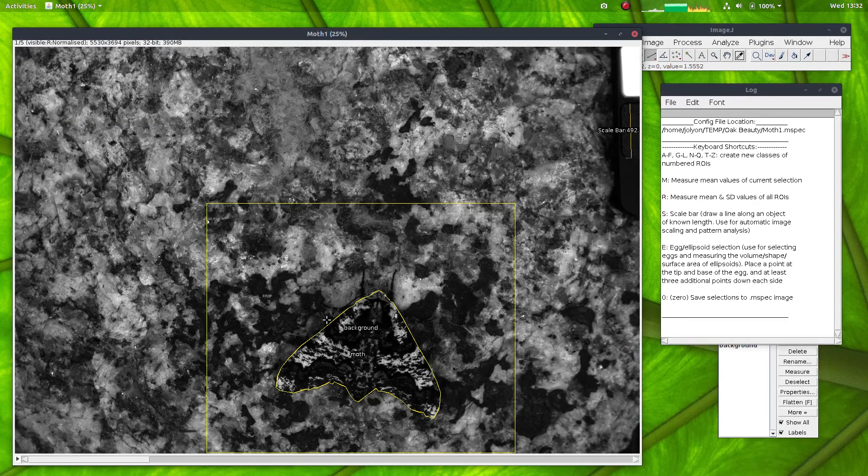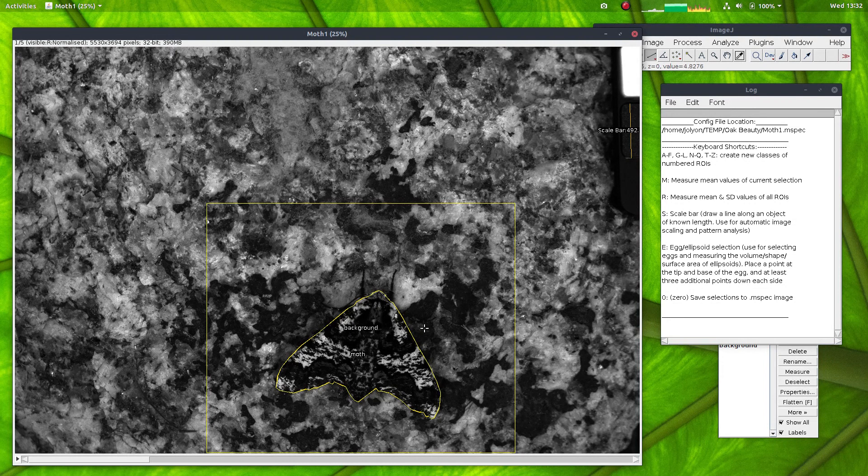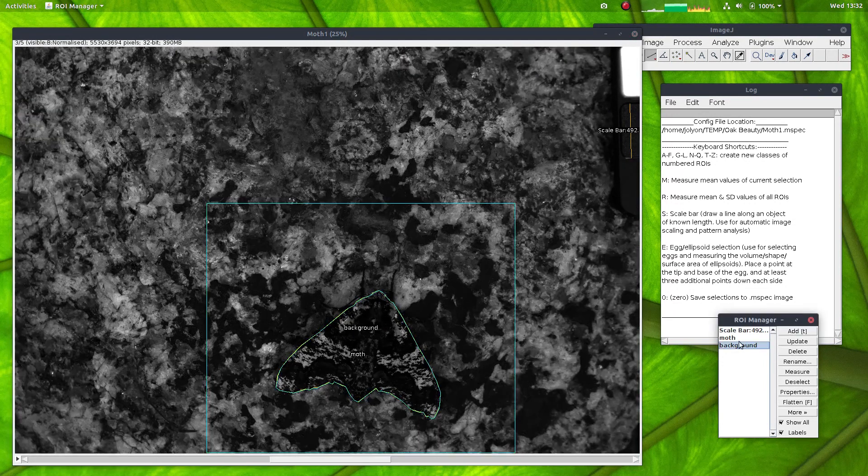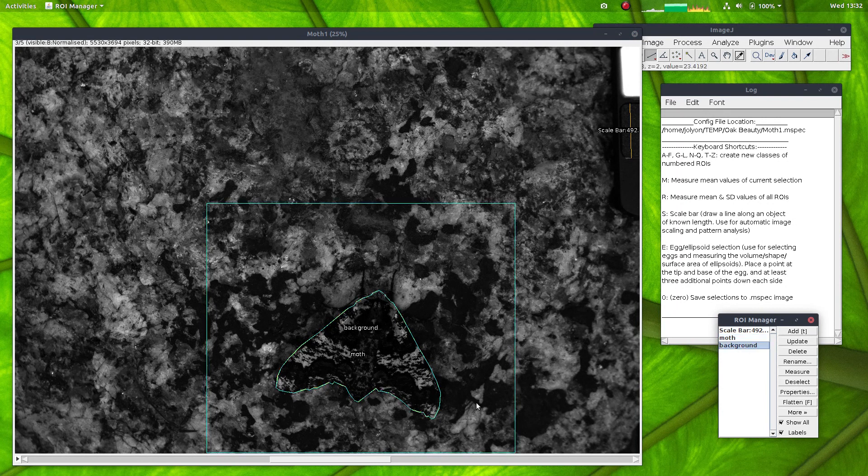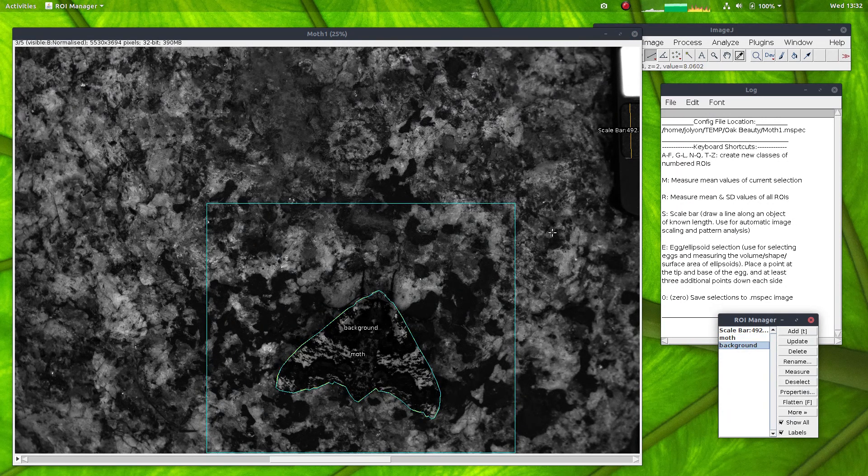You can see I've also already selected regions of interest in this picture. So here we have the moth and we have a background selection, which is an area I've chosen that excludes the moth.